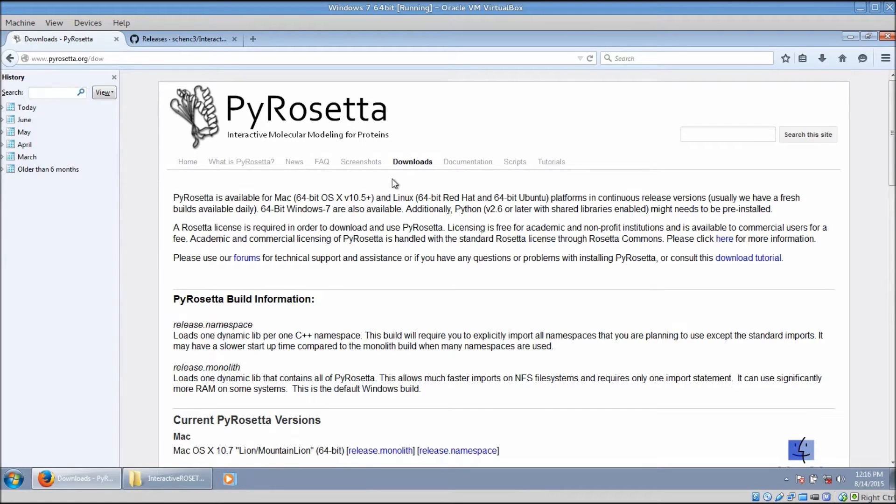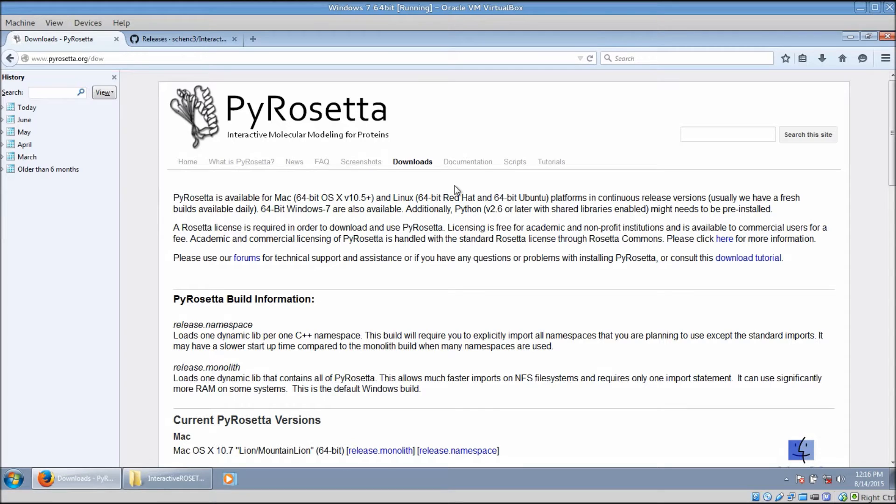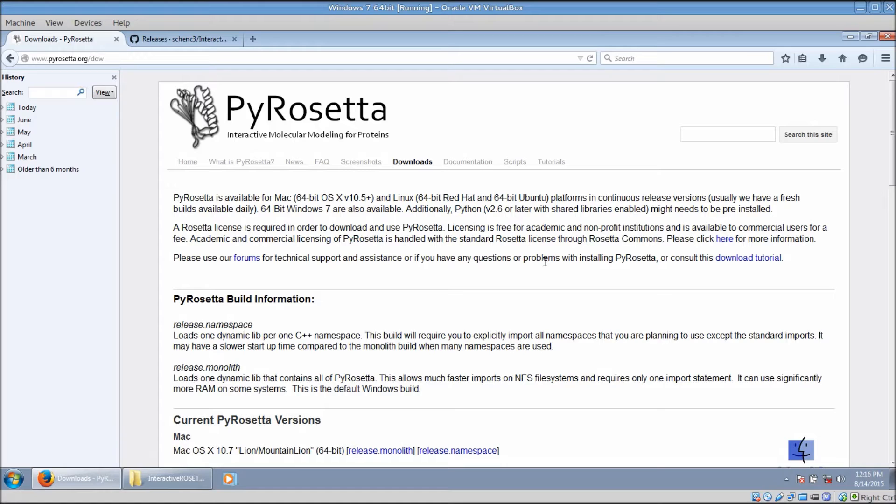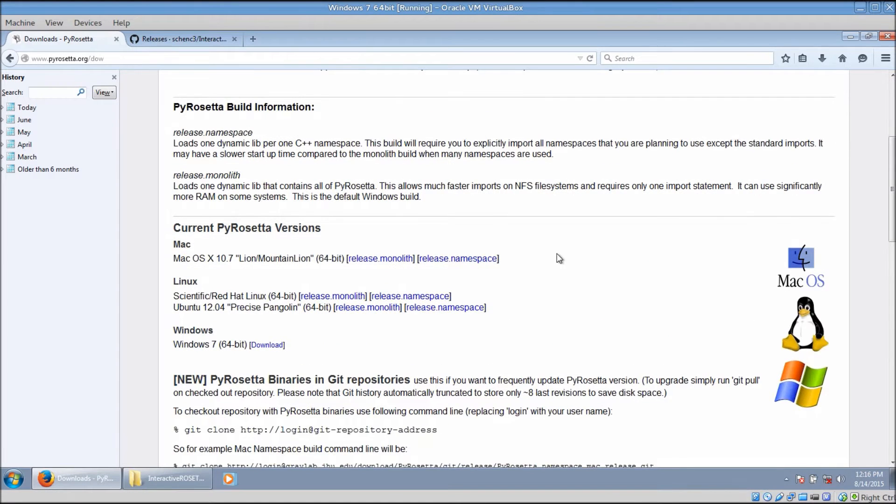The license is free for academic use. A commercial license is also available, but you will have to pay a licensing fee for it. This link right here will take you to the licensing page. Once you have the license, you will be sent a username and password that will allow you to download files from the Rosetta and PyRosetta websites.